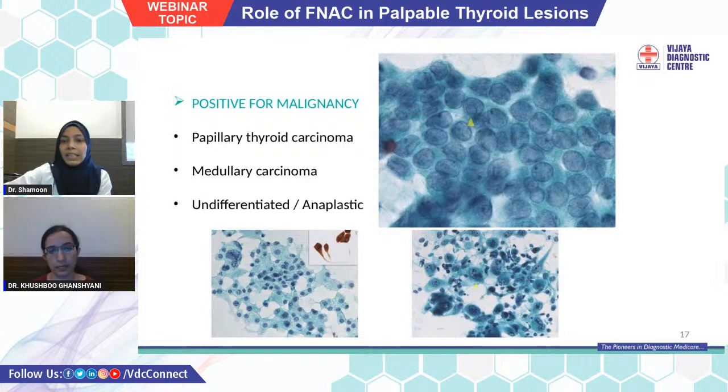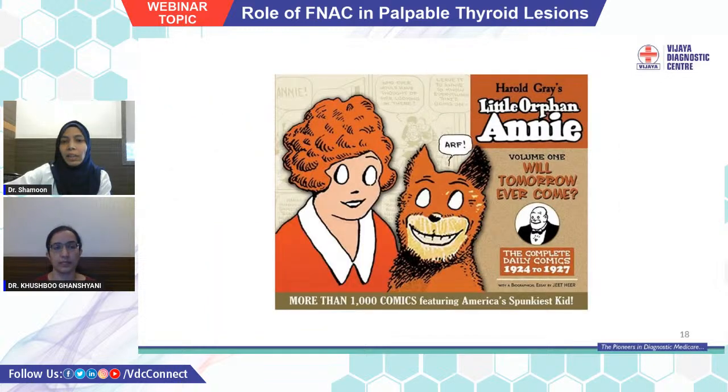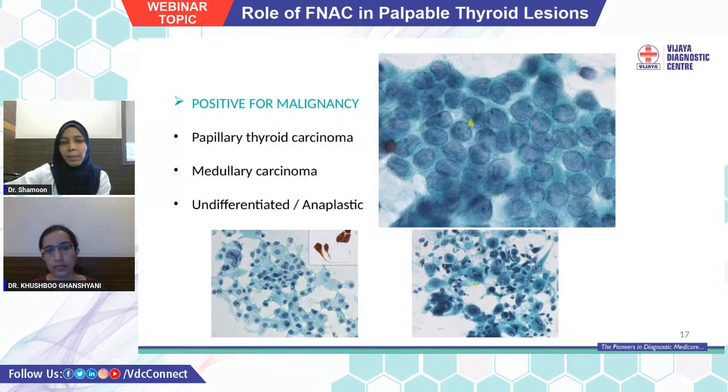Here, this name was given based on an American comic series which was famous during the years 1924 to 1927. And this cartoon was famous, and she has no pupil or iris and clear looking eyes. So, based on that, the name was given Orphan Annie-eye nuclei.